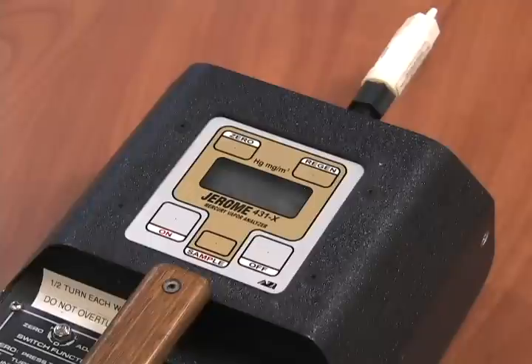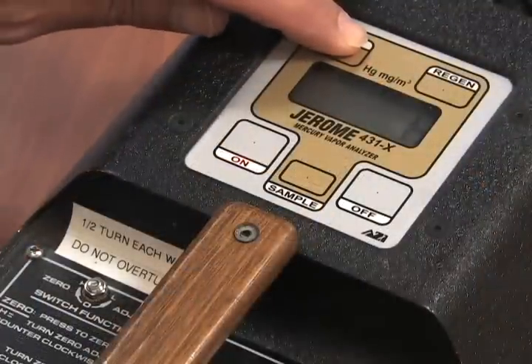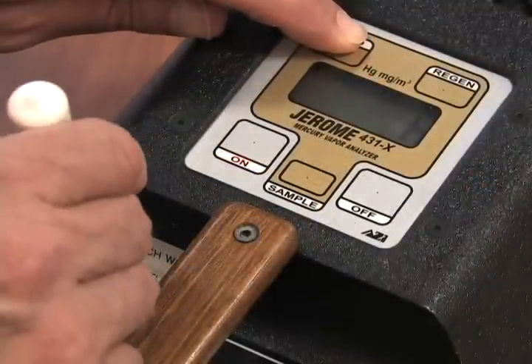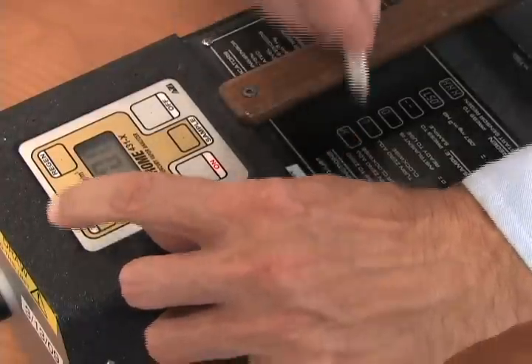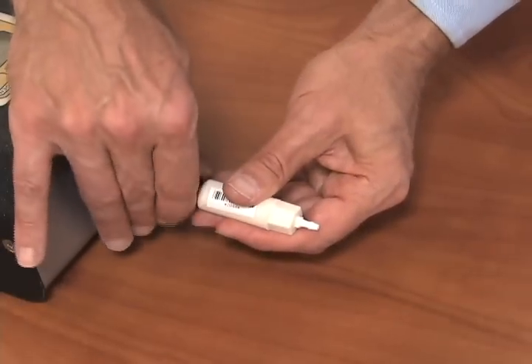If it doesn't, adjust to zero by holding down the zero button and making adjustments with the zero set screw with the screwdriver. Be careful as the set screw is very sensitive. Remove the zero filter when complete.